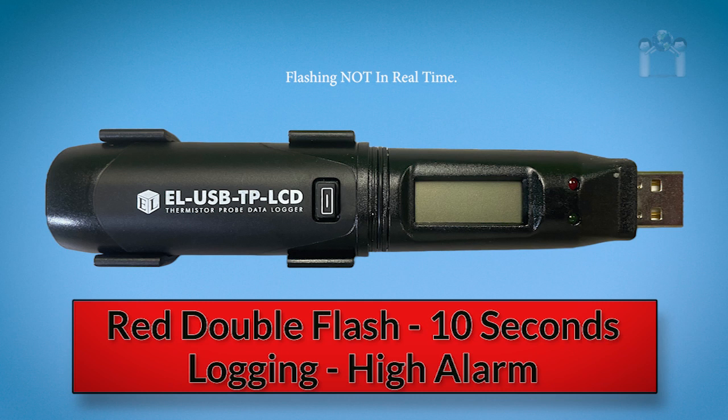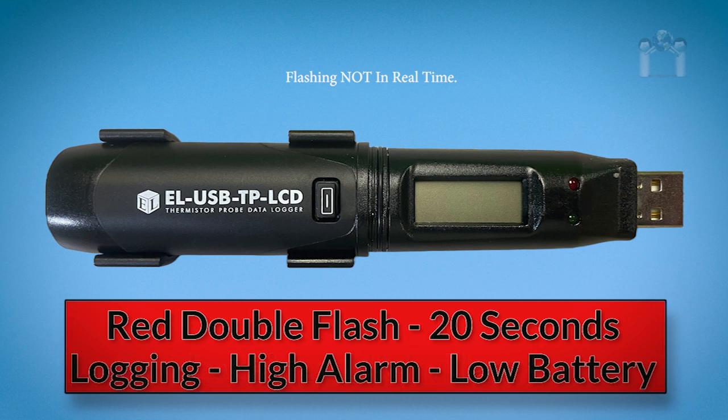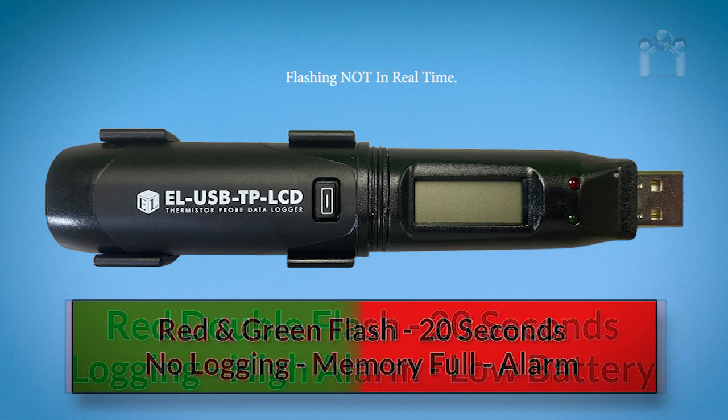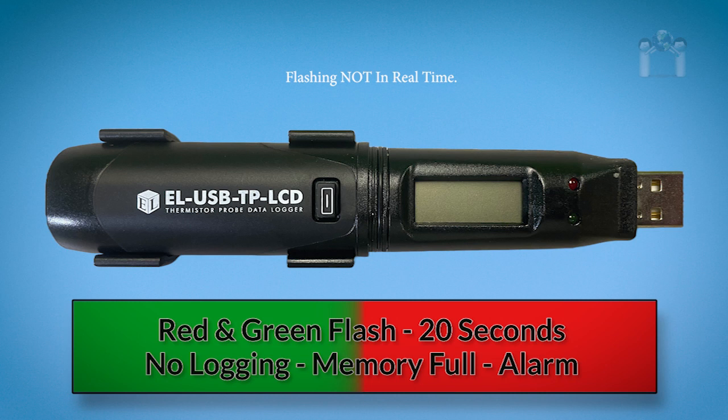A red double flash every 10 seconds means the data logger is currently logging but there is a high temperature alarm. A red double flash every 20 seconds means the data logger is currently logging but there is a high alarm and the battery is starting to run low.